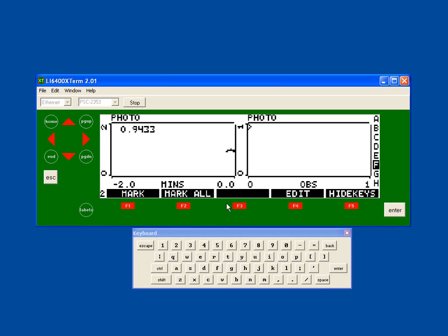On the strip chart, you will notice data appears as a contiguous line. On the XY plot, you'll notice the current data point is a floating triangle, and it's moving around according to the current value on the x-axis compared to the y-axis. As you log a data point, that triangle will turn into a dot, and then the current value will then again be a floating triangle.